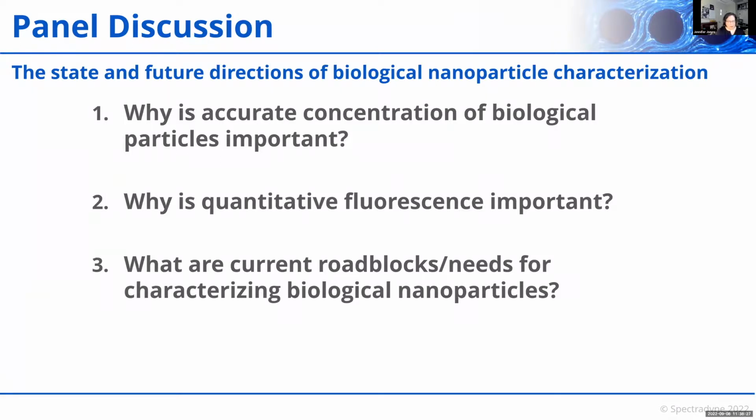I think it's really encouraging to see the field continuing to step forward in this direction, and to be able to have an instrument that has orthogonal assessments with the same sample. Orthogonal measurements help us quite a bit in assessing the reality of what we're seeing and the attributes of the particles we're studying.